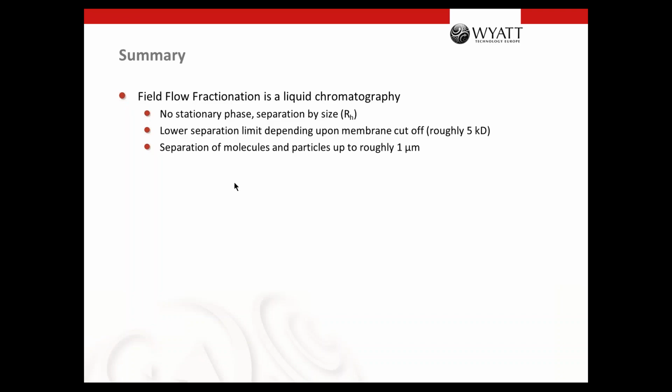So with that, I want to summarize my talk. I hope I could show you that FFF is a liquid chromatography method where we have no stationary phase, and the separation happens due to the hydrodynamic radius of the sample and the diffusion coefficient. We have a lower separation limit depending upon the cutoff of the membrane. The lower limit is usually 5 kilodalton, but we also have 2 and even below 1 kilodalton membranes available. And the upper limit is roughly 1 micrometer for molecules and particles.